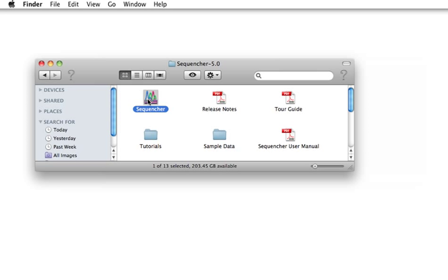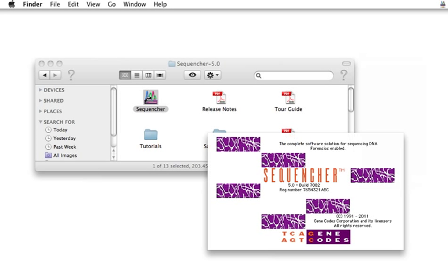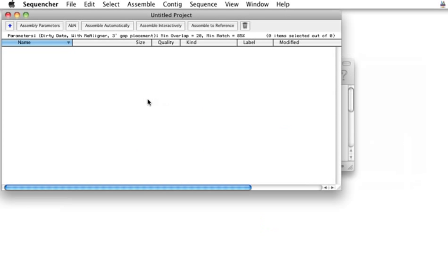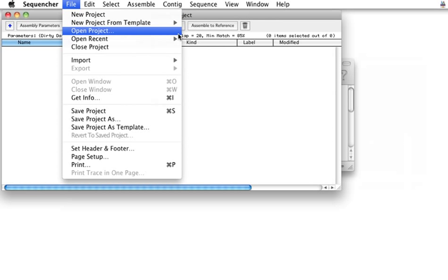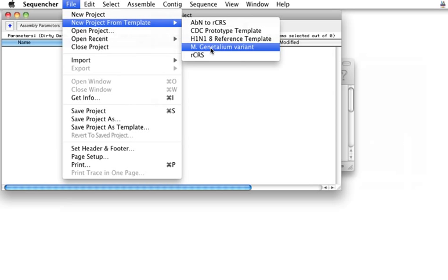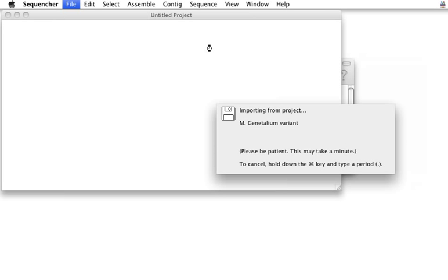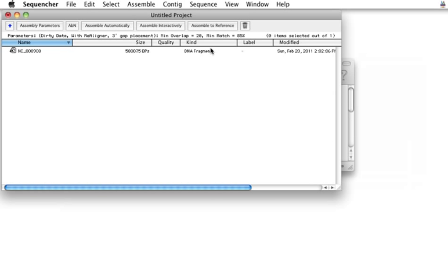I'm going to launch Sequencher 5.0. If you're familiar with Sequencher, one of the things you might be used to doing is loading all of your fragments into the project window. We're going to start with a reference sequence, and I've set one up as a template, a variant of mycoplasma genitalium, a fairly small bacterial genome, the smallest free-living bacterial genome, I think.